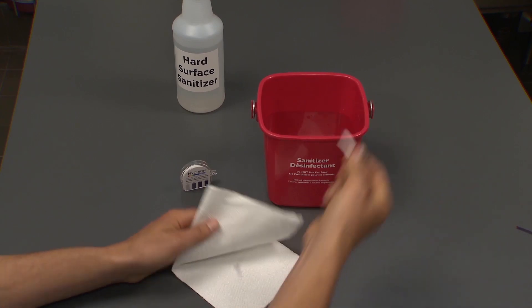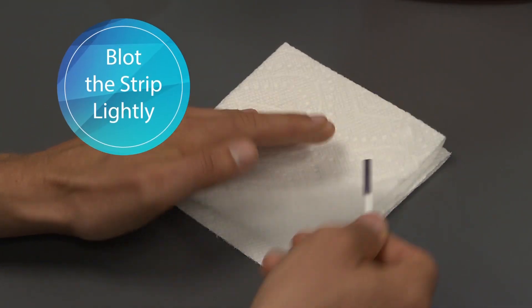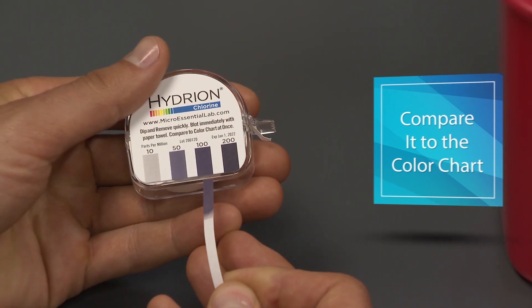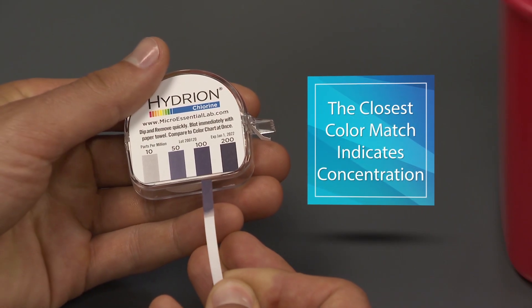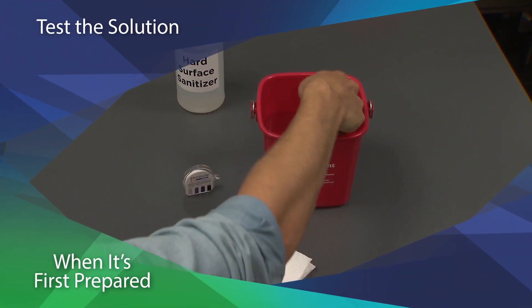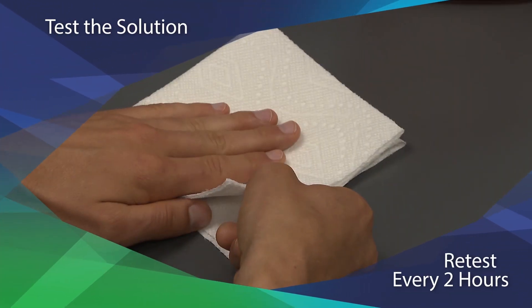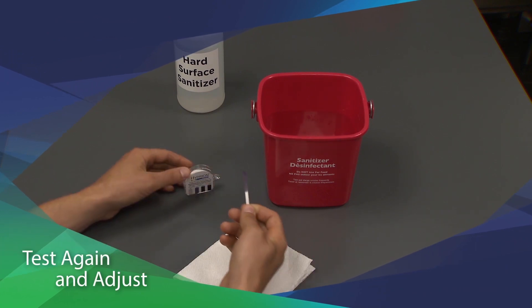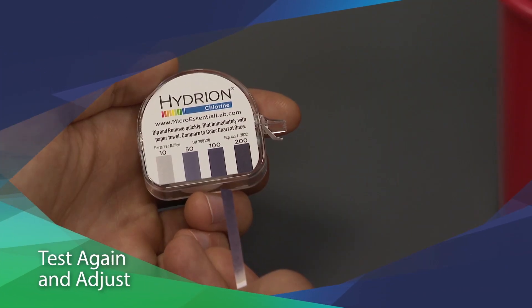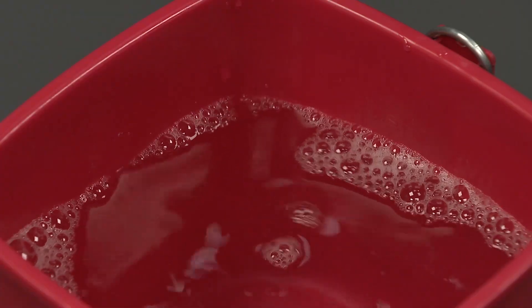Remove the test strip from the solution and blot it lightly with a paper towel. Compare the color on the strip with the kit's color chart — the closest matching color indicates the free chlorine concentration. Test the solution when it's first prepared and retest it every two hours or so. If the concentration isn't at your target, test it again and adjust the solution as necessary, or just make a new batch.